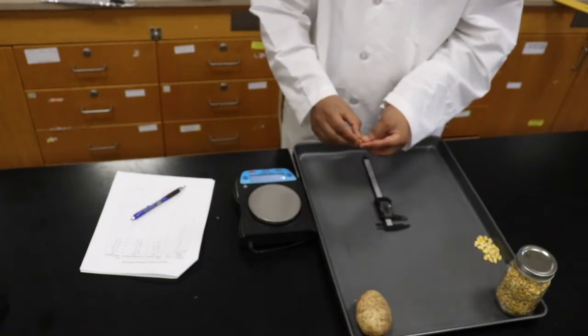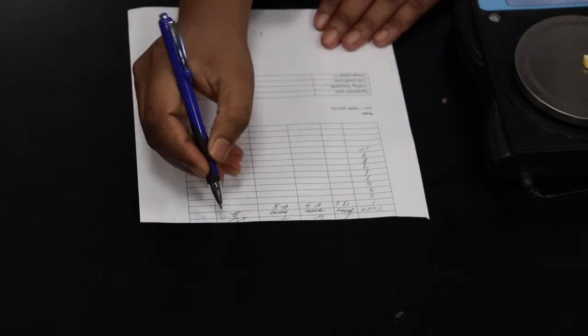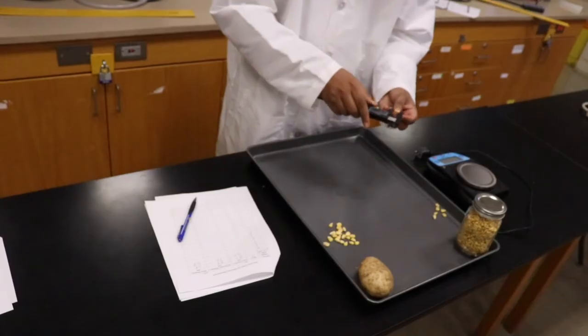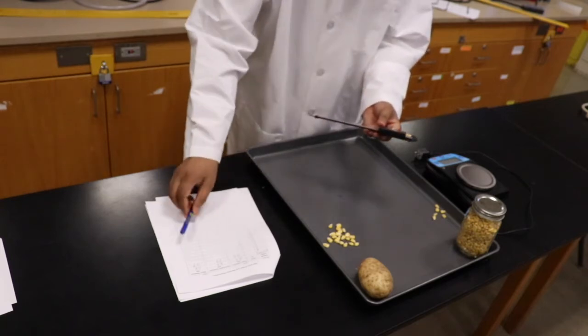After that, determine the weight of the corn using a small scale. Record the number. Repeat the same procedure to measure 20 corn kernels.